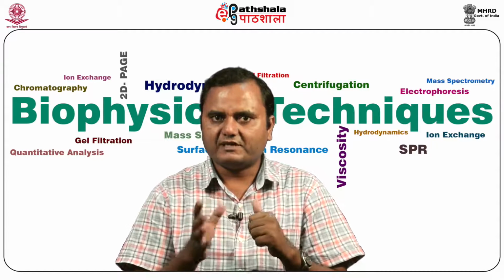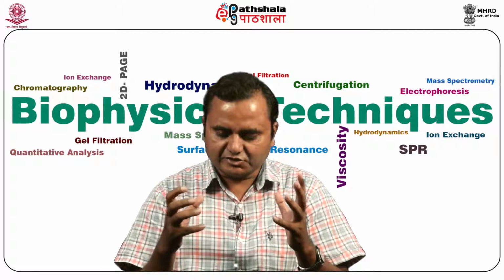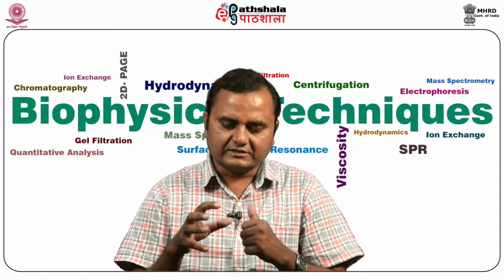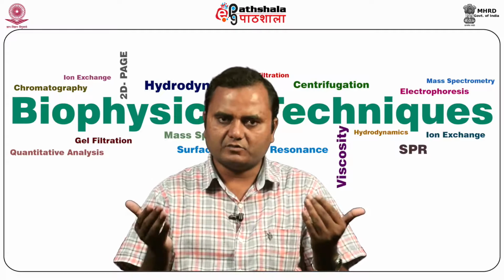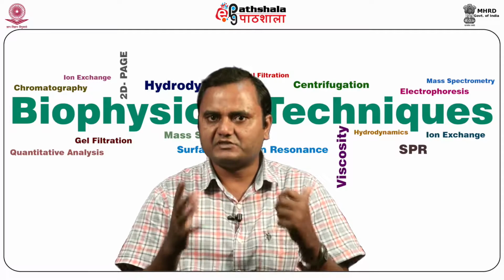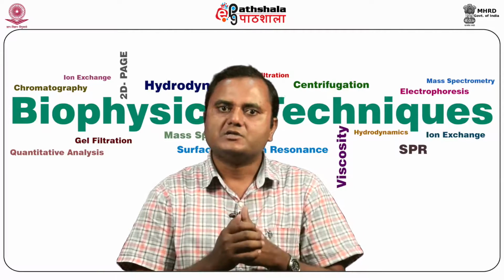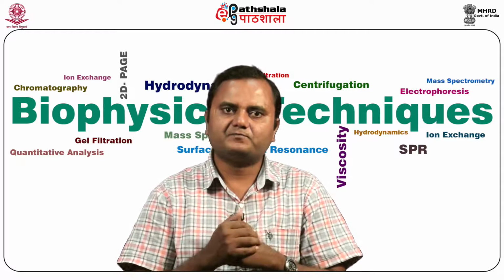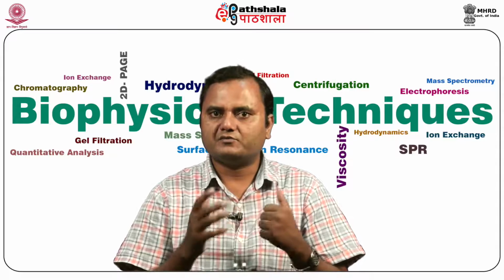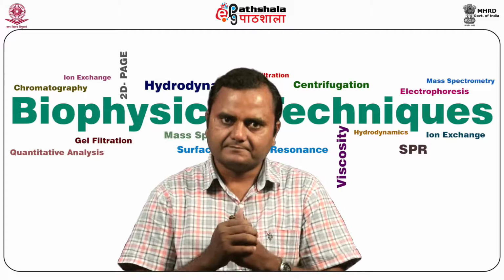One very important thing with this ultracentrifuge is the application of the vacuum system, because this runs in a chamber where the pressure is 0, meaning it is a vacuum. If there is pressure, then the air creates a frictional force, and the frictional force is so high that the chamber can burn out. So to avoid such friction, the chamber should be vacuumed, so there are no frictional forces, and the centrifugation can be done very easily.